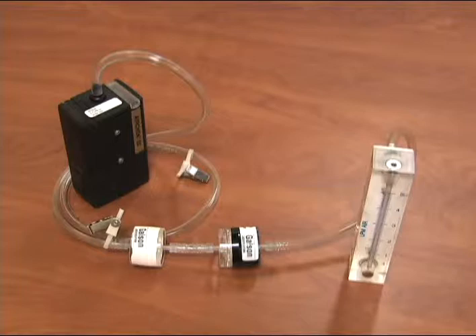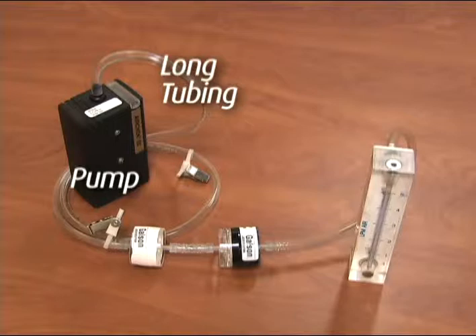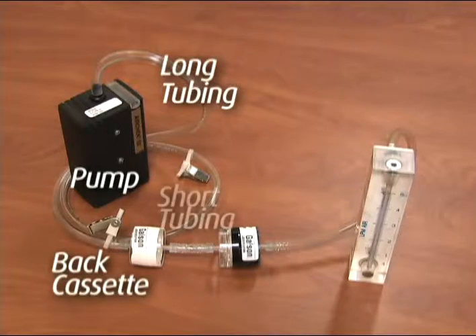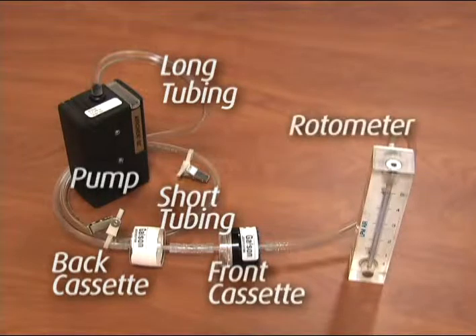The order of the components for calibration is pump, long piece of tubing with lure adapter, back filter cassette, short tubing with two lure adapters, front filter cassette, and rotometer.